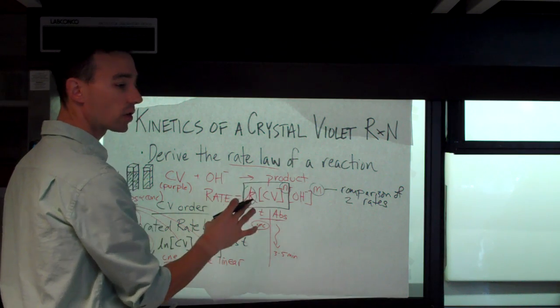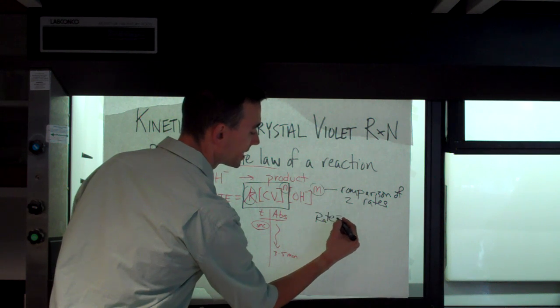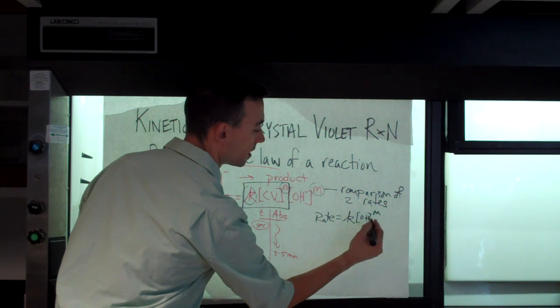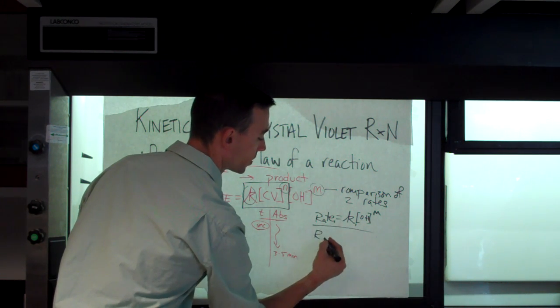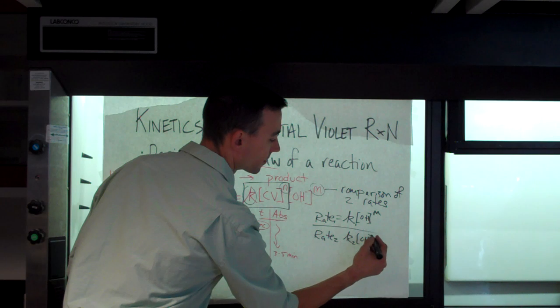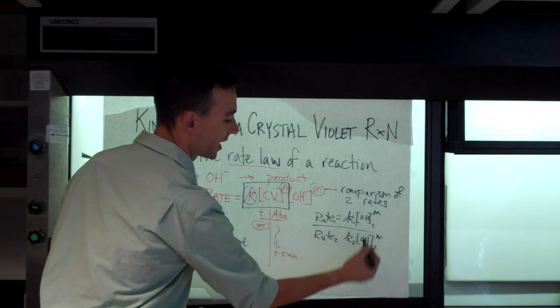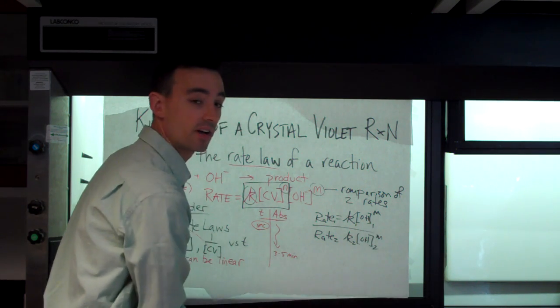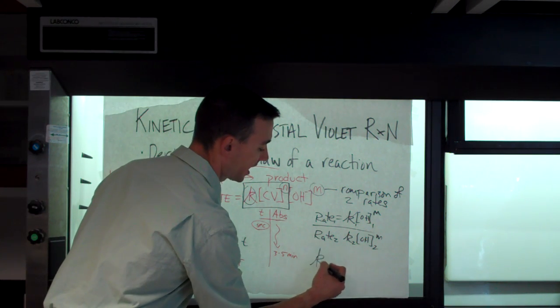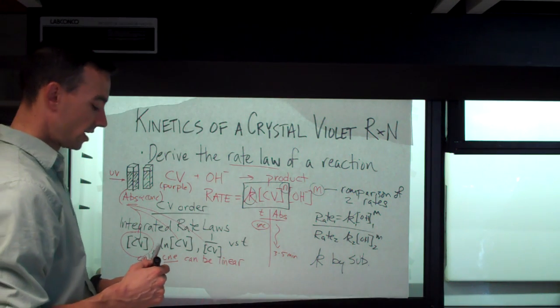But by comparing two trials, we will be able to, like we've done in the method of initial rates, although it won't be exactly this way, divide one trial by the other, essentially. And all of this won't cancel out, but we'll get numbers, and this will allow us to figure out the value of M. And then substitution gives us the value of K. Okay? So these are the basic details.